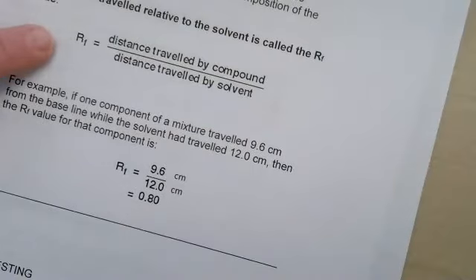Everybody's chromatogram is going to be a little different. Your liquid level may start a little bit different. There may be a lot of foot traffic around you, so it makes it bump a little. Maybe your application is a little more concentrated than someone else's. So from team to team, they will not be identical, but incredibly similar. But what should be on point is what we measure to calculate.